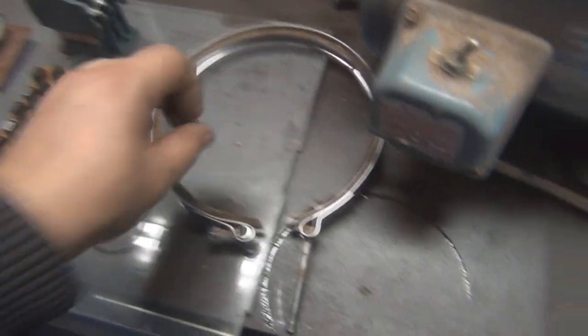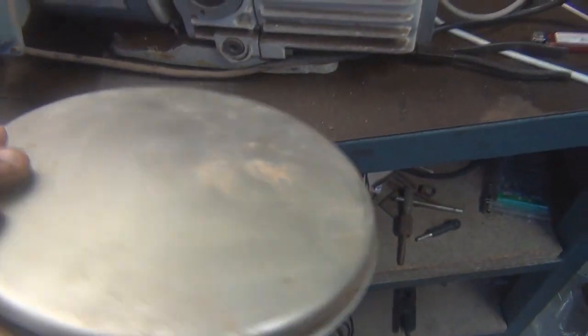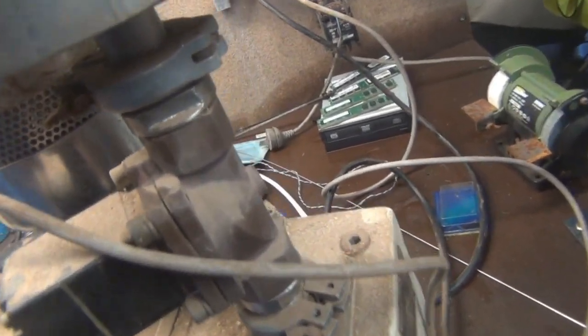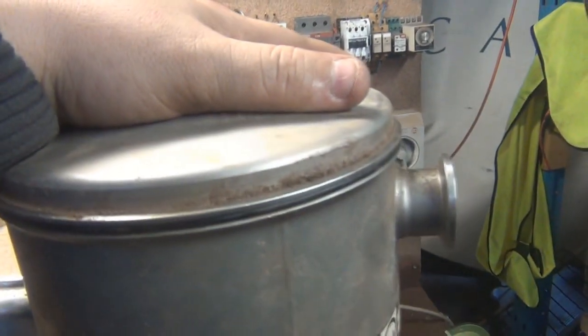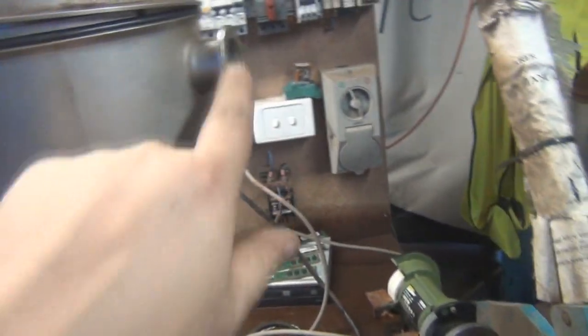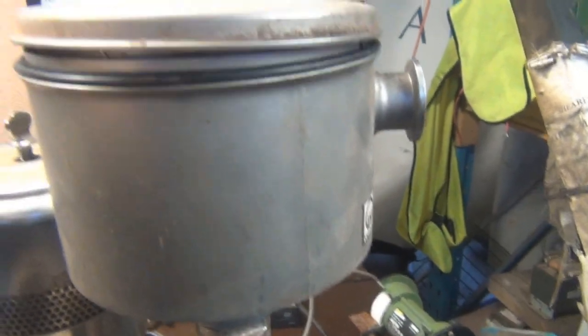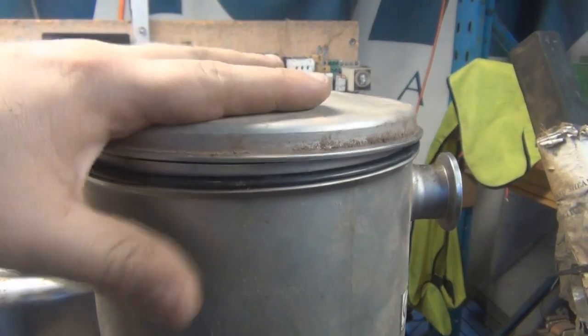There's our little piece — that sits on top and gets clamped down. It forces the air to come in the sides and then flow up over the sides of the little filter and then down through the filter, if that makes sense.